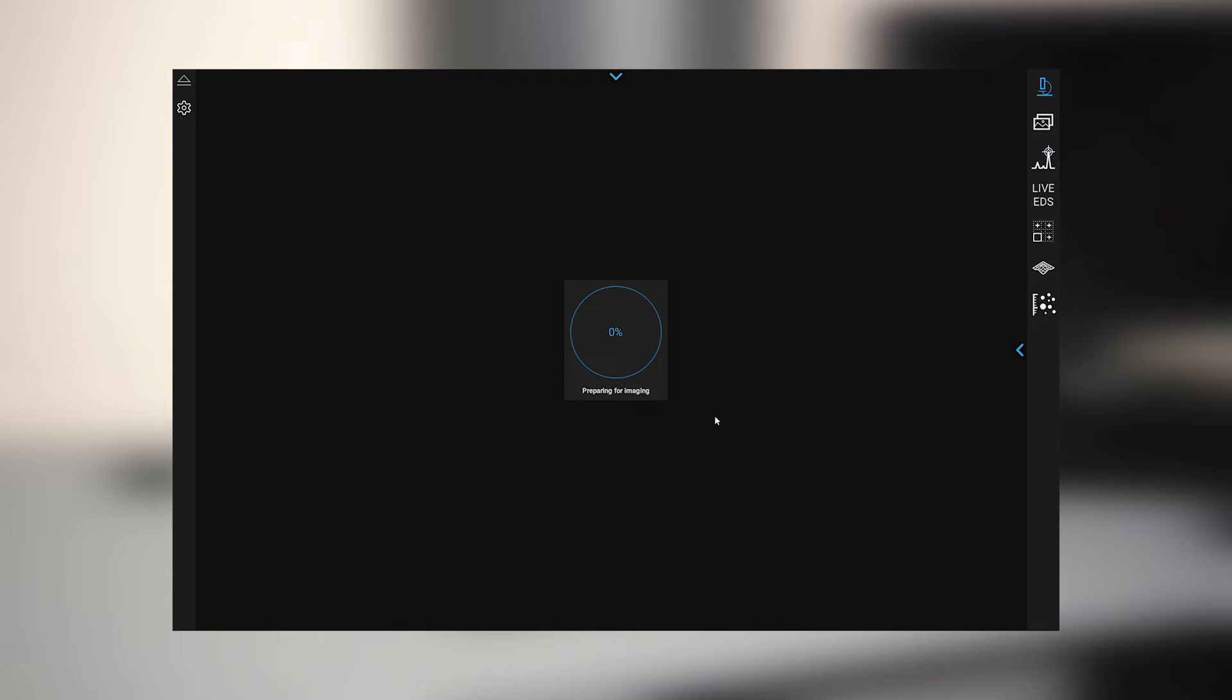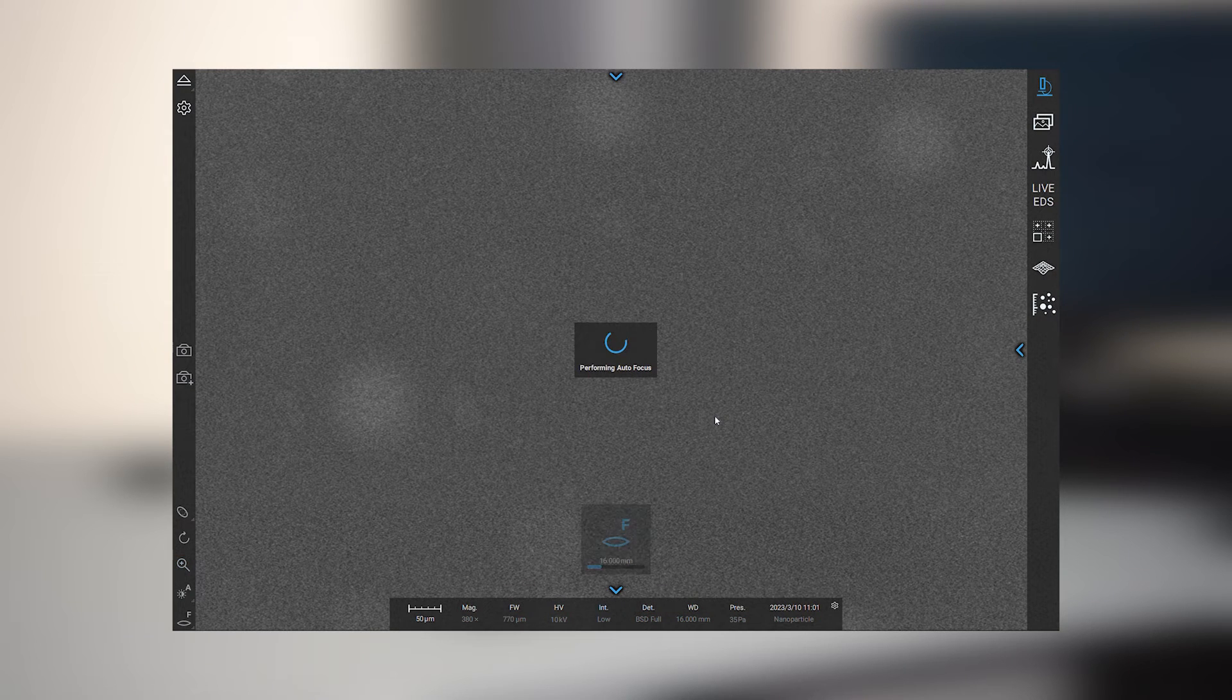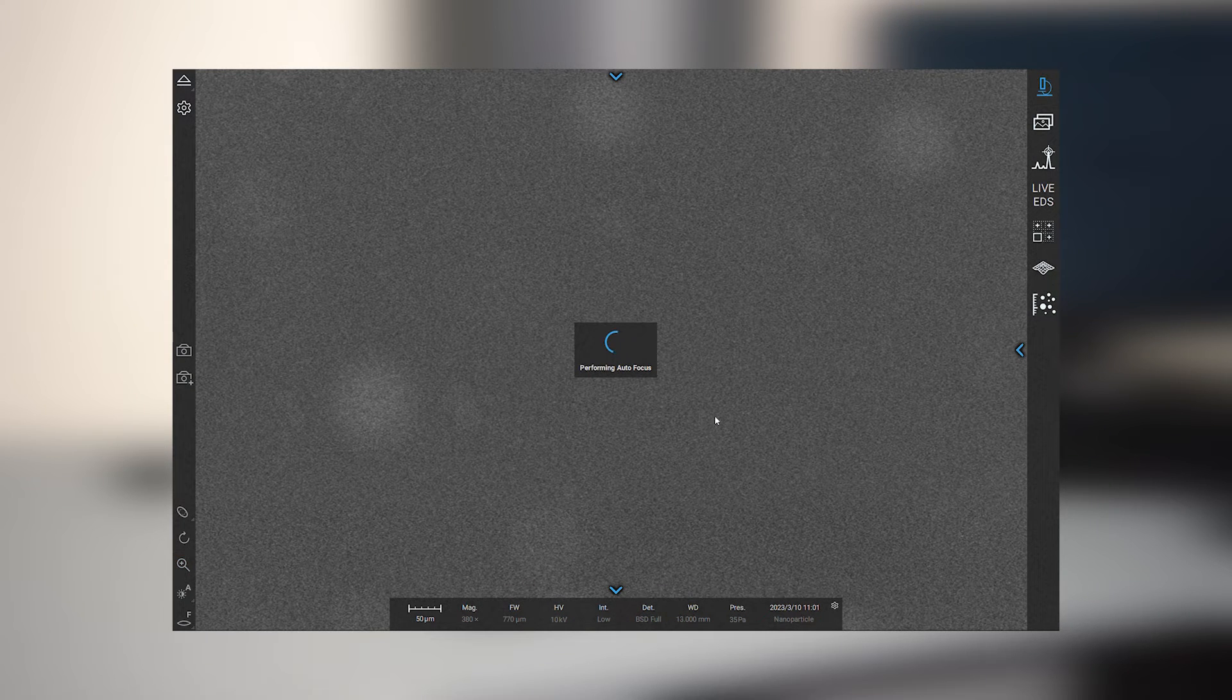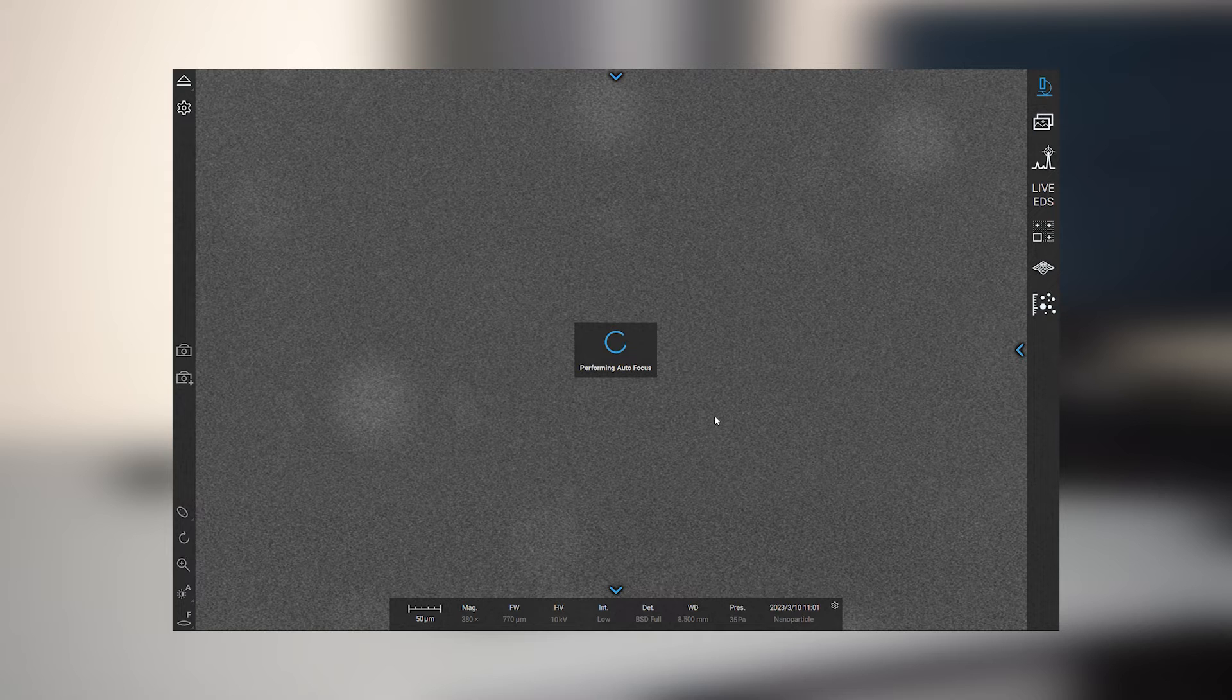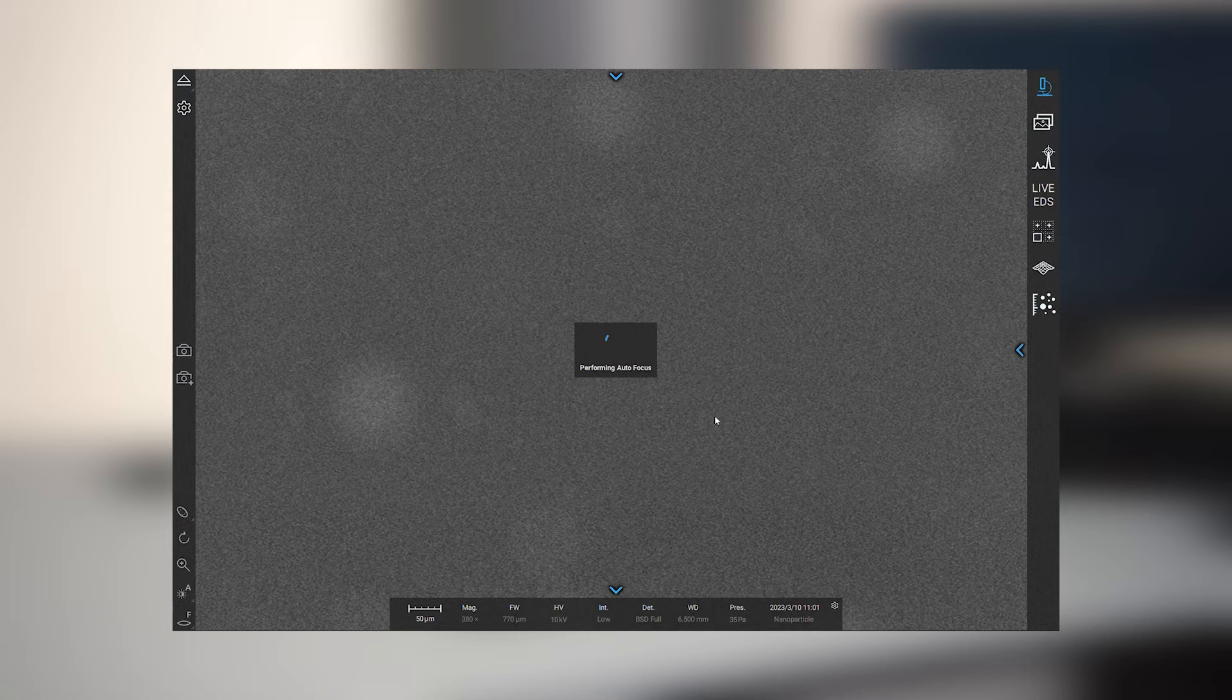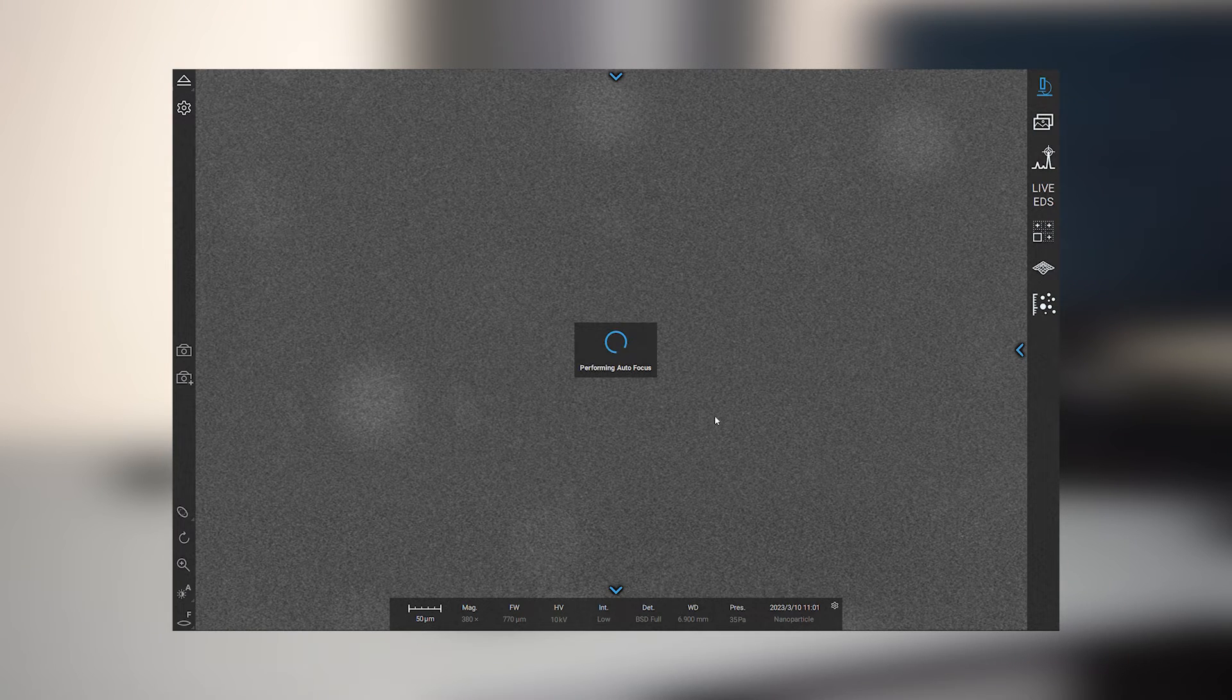And once the image pops up it's going to automatically run through a procedure in which there will be an auto focus and an auto brightness and contrast. And so without very much input from the user we'll be able to immediately begin capturing high quality images.